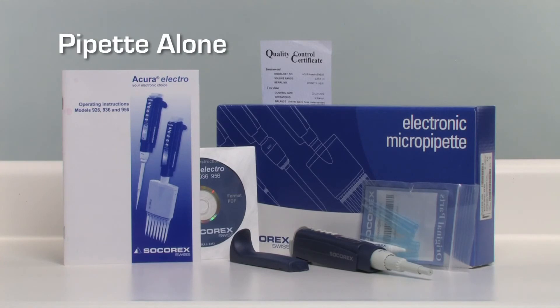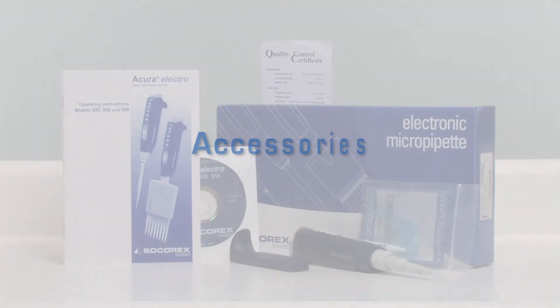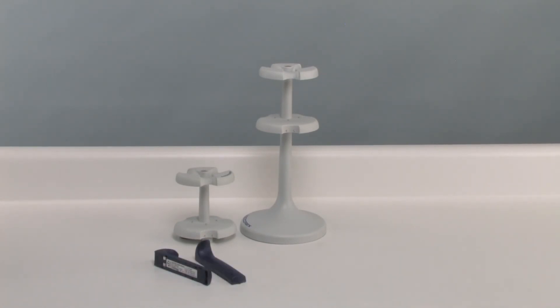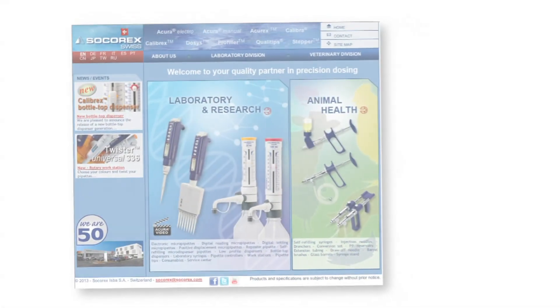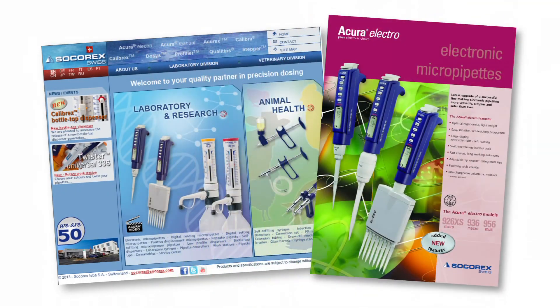Thereafter, additional pipets can be purchased alone and charged on an existing stand. The following accessories are available separately: a pipet charging stand, a compact battery charging rack, a spare battery, a power supply, and volumetric modules. Additional information on the Acura Electro pipet is available on our Socorrex webpage and in our sales literature and operating instructions.